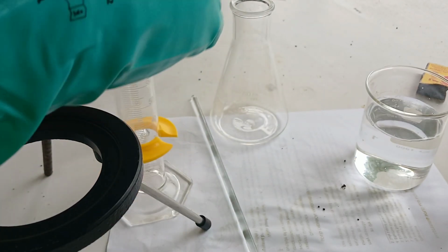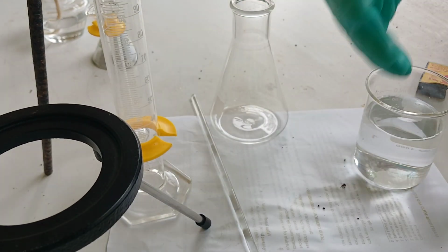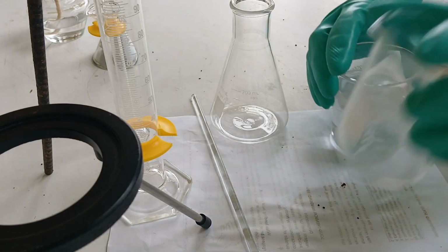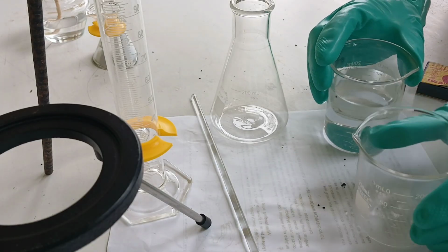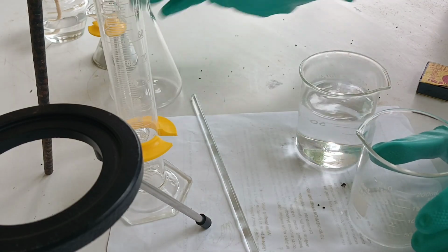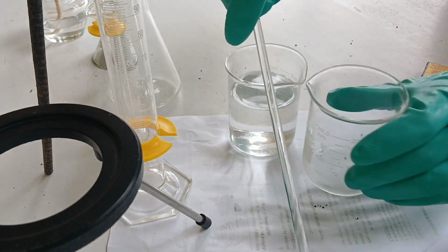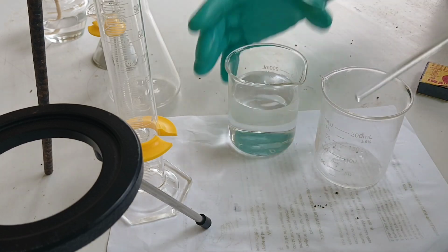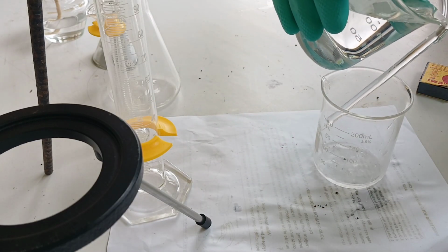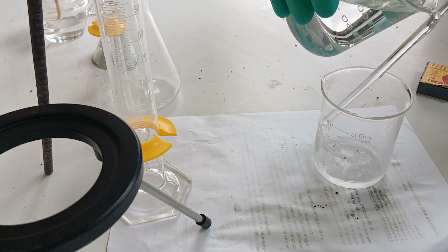By this time, we need to master how to transfer and handle chemicals in the form of liquid from one container to another. There are a lot of methods. This is an open mouth container, a beaker, and the other one is an empty beaker, and we're trying to transfer the water from that to the other container using a stirring rod as your pouring guide. Then yes, that's the best technique.